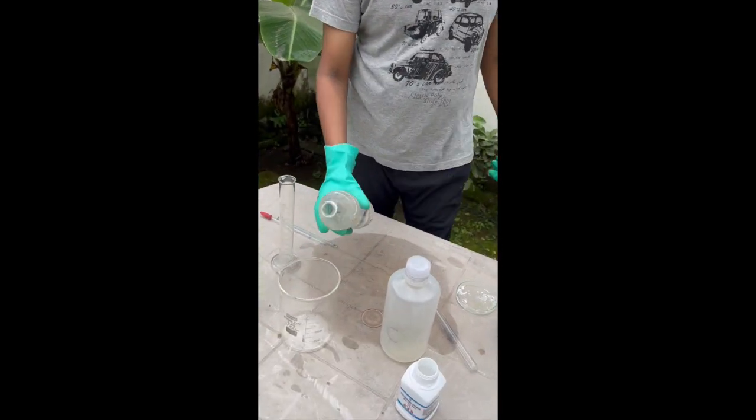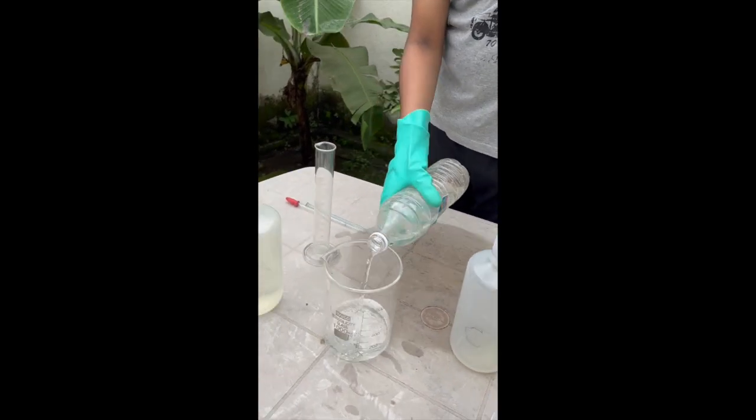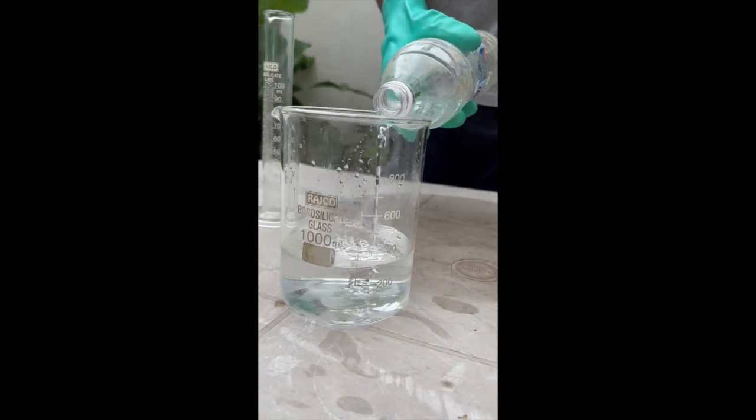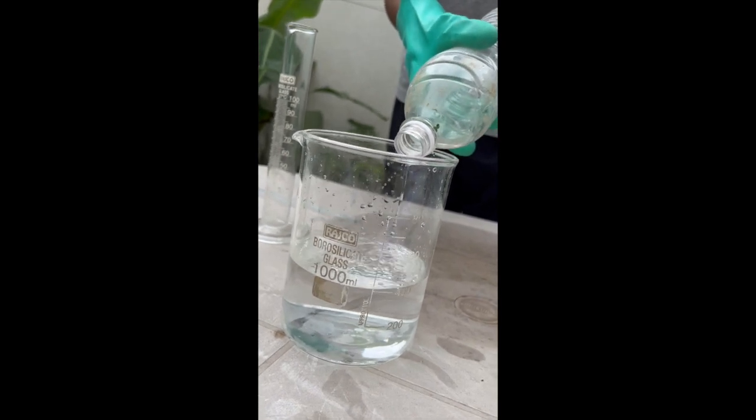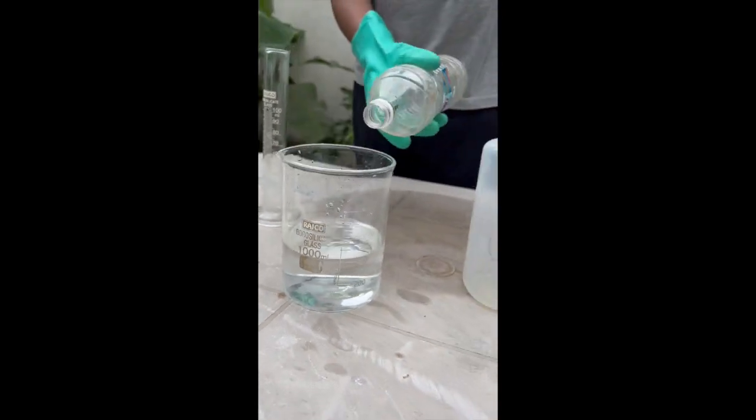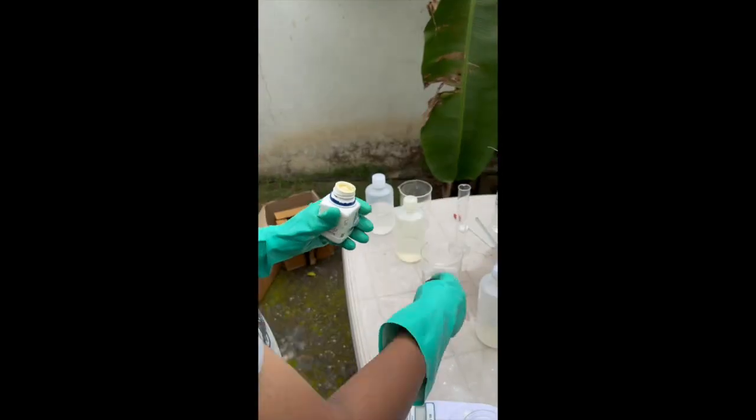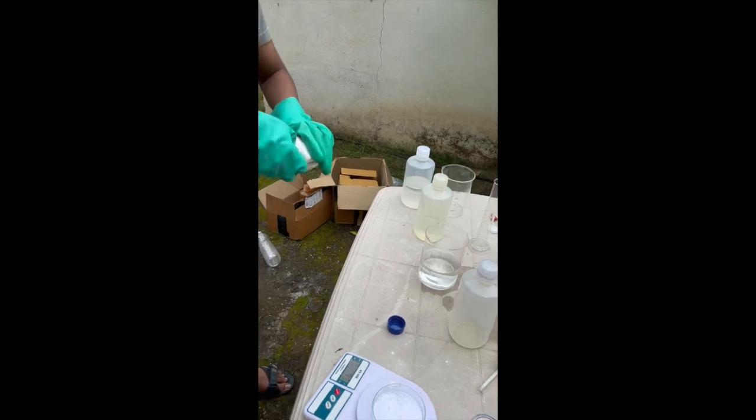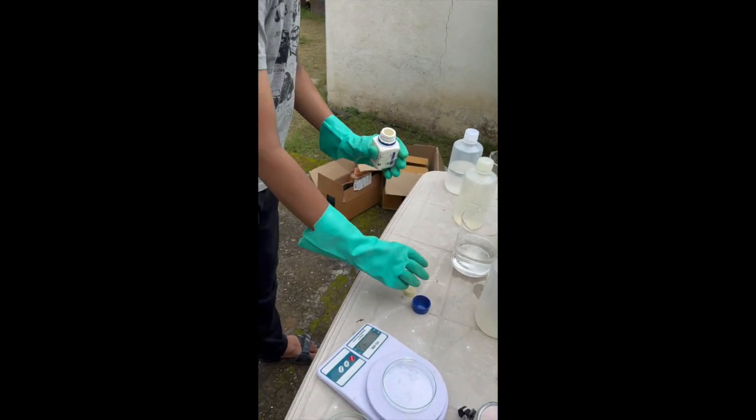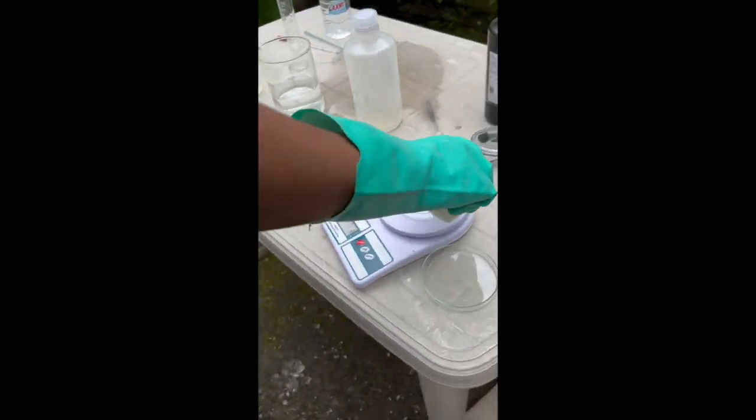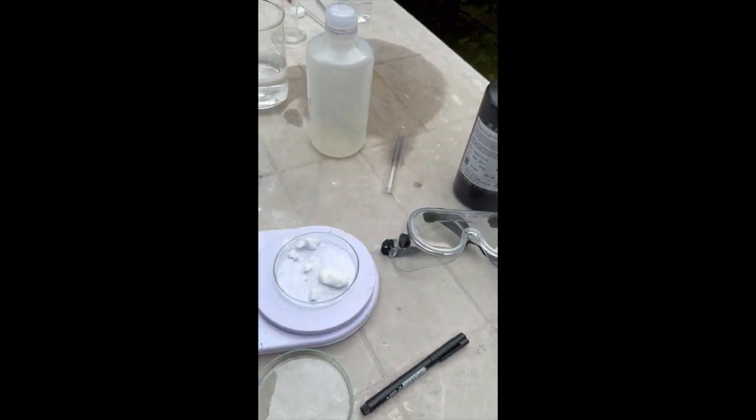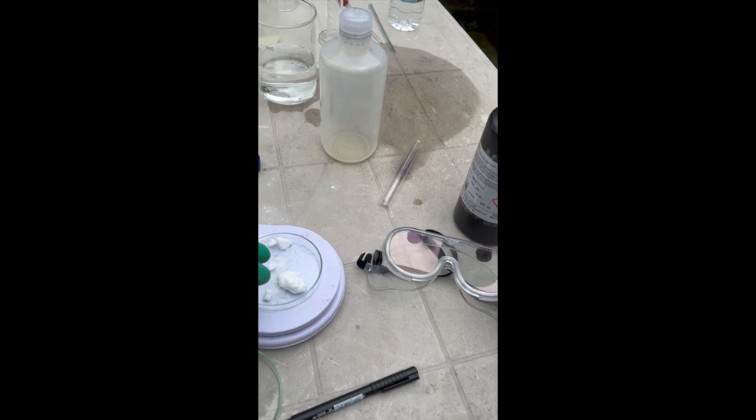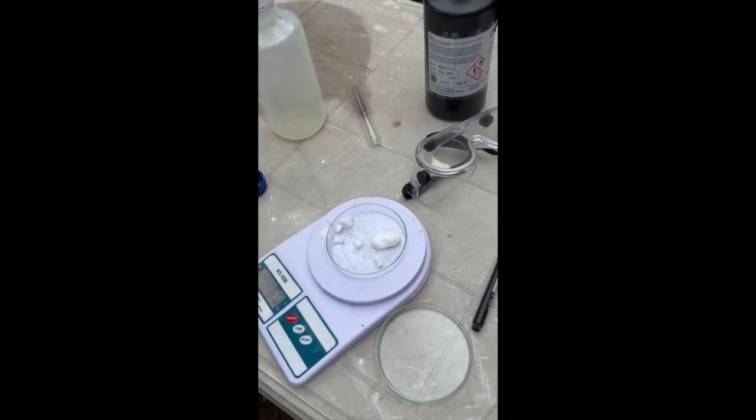Solution C will take us the most time. To another beaker, I add about 450 ml of distilled water. Now, I add about 8 grams of malonic acid. For this, I will have to measure it first and I am doing this on a petri dish on a weighing scale, which may be very inaccurate, but it's fine for this reaction.